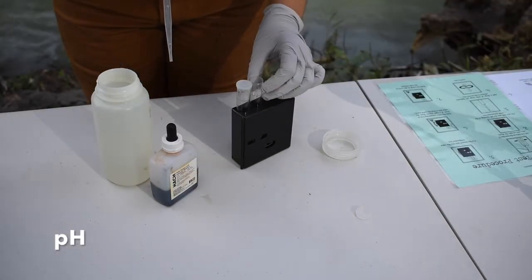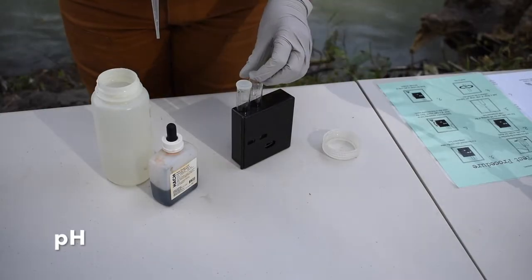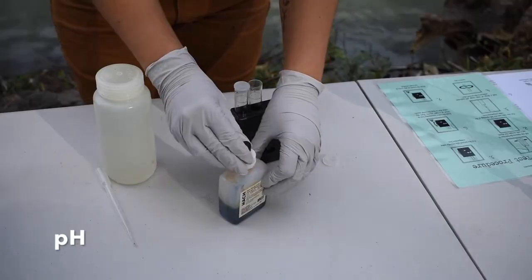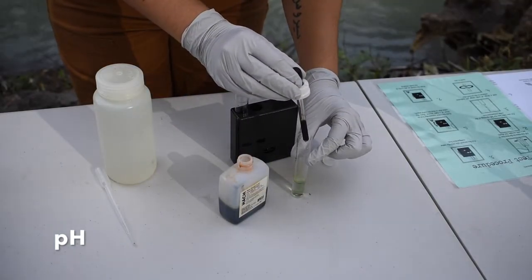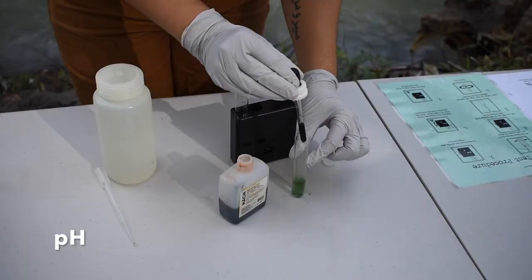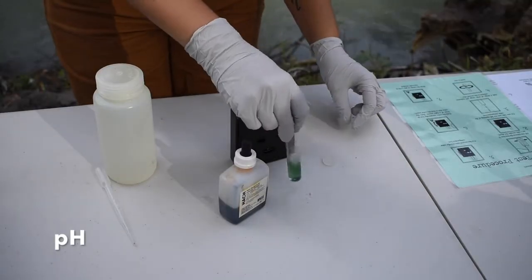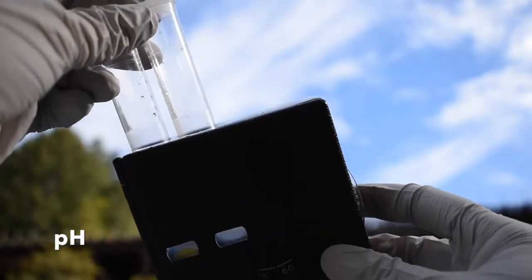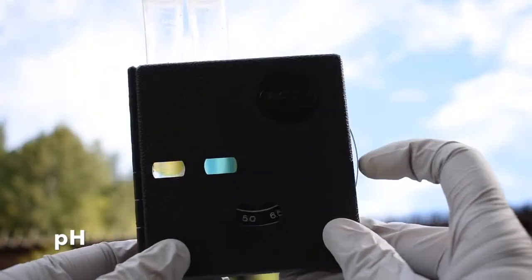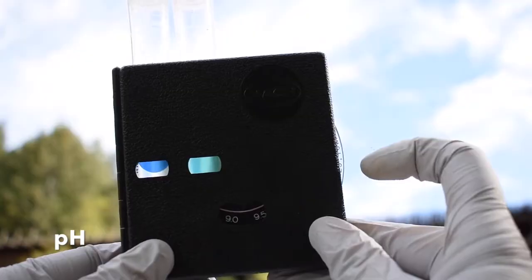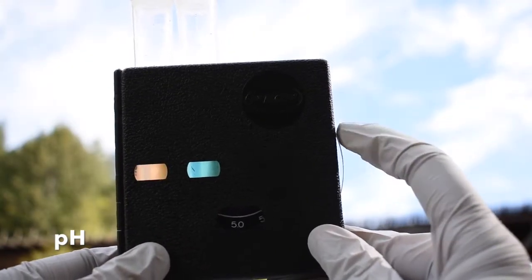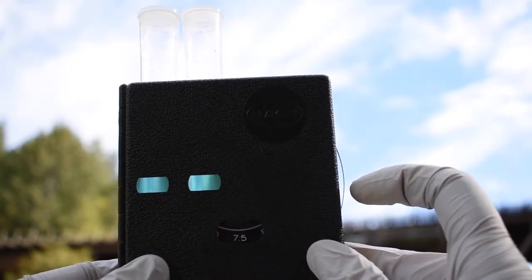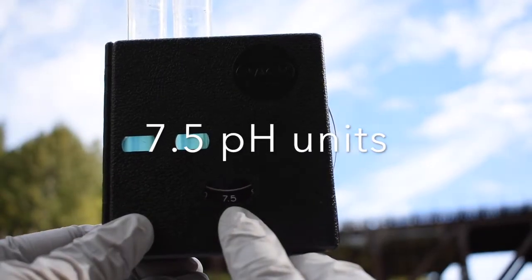Next, we will add 6 drops of our pH indicator solution to one of the tubes. After swirling to mix, we put that tube into the right slot in the color comparator box. Next, we rotate the color wheel until we find a color that matches our sample. The number on the bottom of the comparator box will show us our pH value.